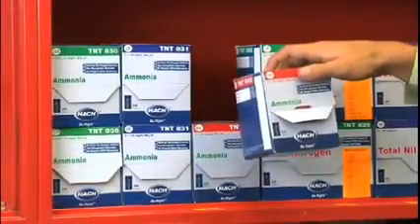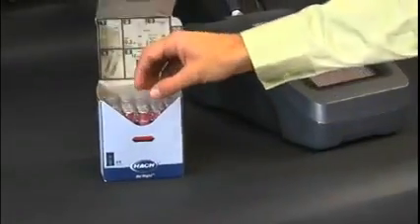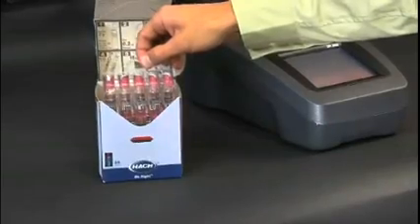Let's start by identifying the parameter and range you need to test. The color-coded vials and packaging enable fast and easy recognition, which reduces errors.